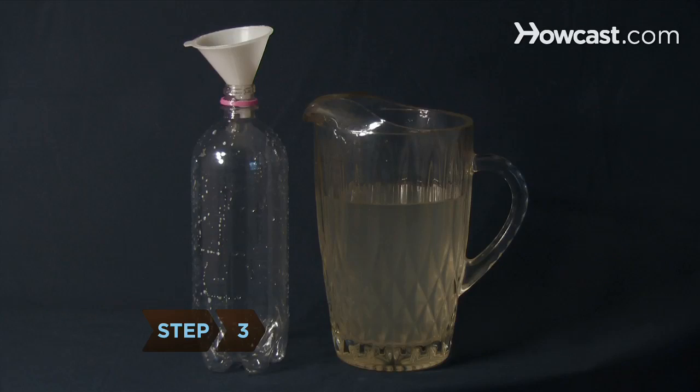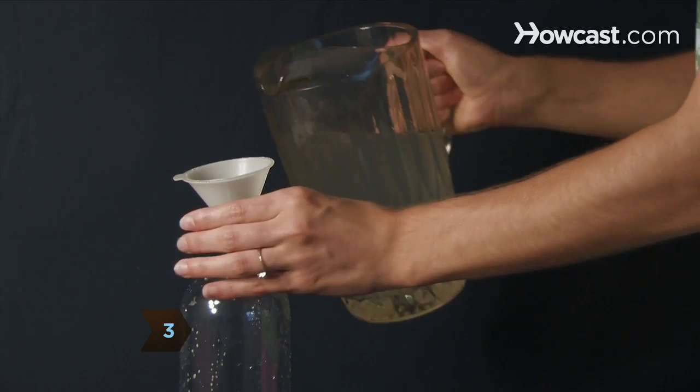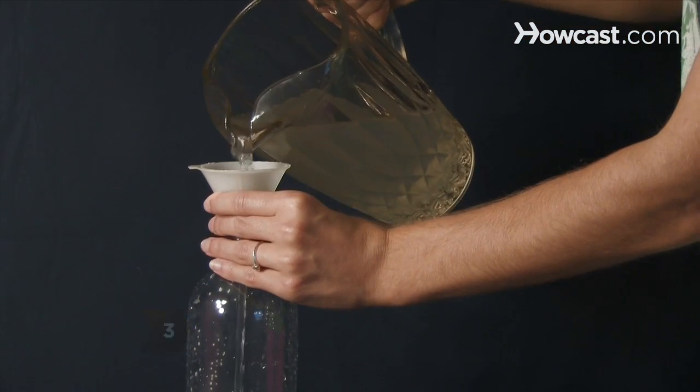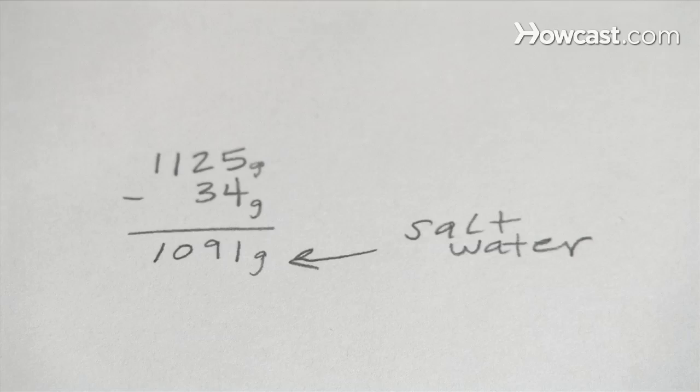Step 3. Replace the tap water in the bottle with room-temperature saltwater and weigh it, then subtract the weight of the empty bottle and record the weight of the saltwater.